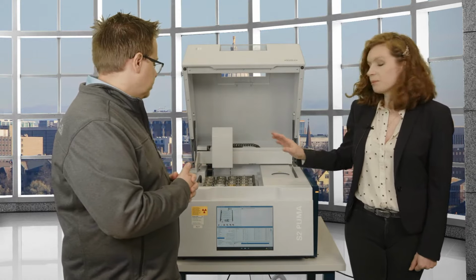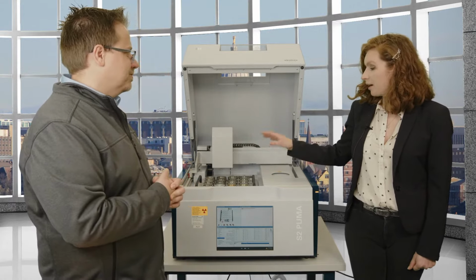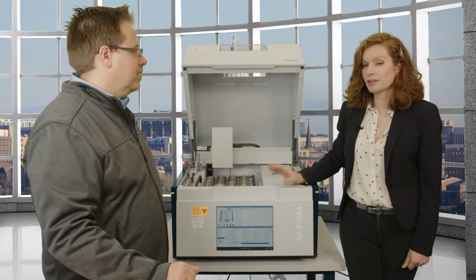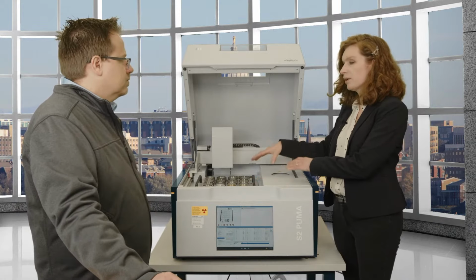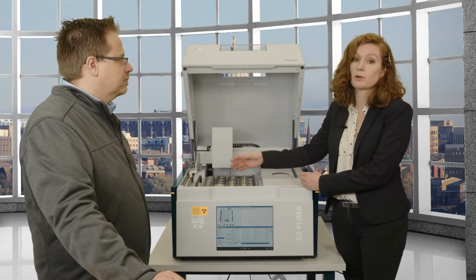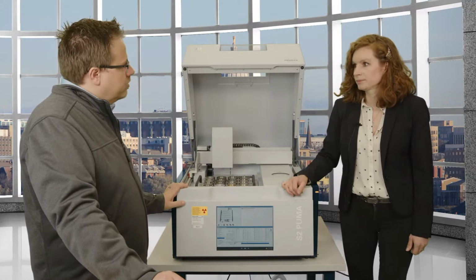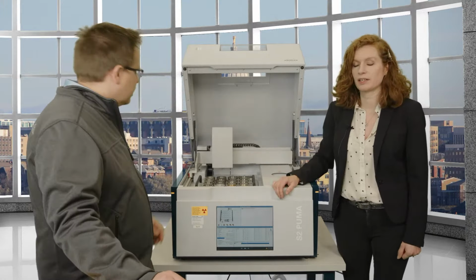We played a little bit with this machine so that we can show you how it moves. But usually, if I open the hood, this arm would not be moving, because it's a moving part that should not bump into you while you're trying to do something. On the other hand, if you have one of these XY changers, it's cool that while it's measuring, you can go in and exchange samples, and you can mix and match. They don't all have to be solid or measured in vacuum. You can have a liquid here, a powder there, and mix them all. Some of these machines you can even have externally loaded. This one does have a connection in the back for automation.